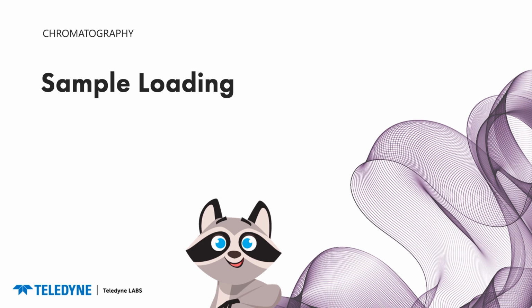Next, we're going to get into sample loading, whether you should use liquid loading or if you should use solid loading, and some of the benefits for each of those.